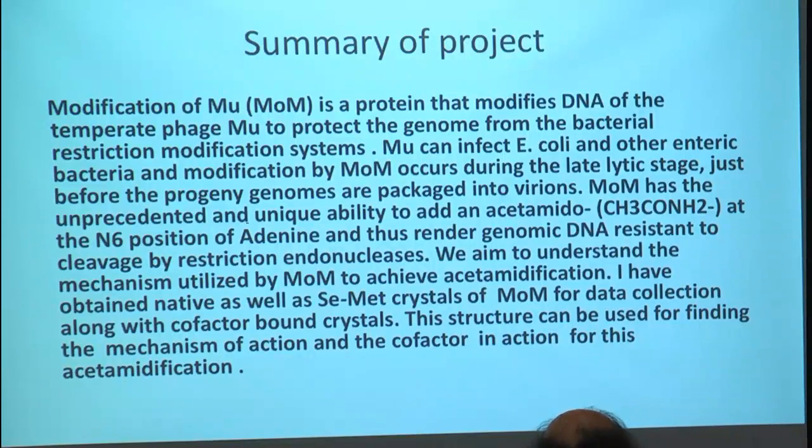We also have another way, by which we could take the cell lysate, concentrate it, and then soak it with the crystals and see what's happening. So the main objective is to understand the mechanism by which it acts. And we're also planning to get the structure with the DNA, so that could solve a lot of the problems. So that's it. Thank you.